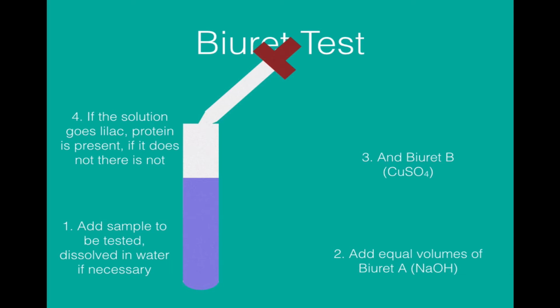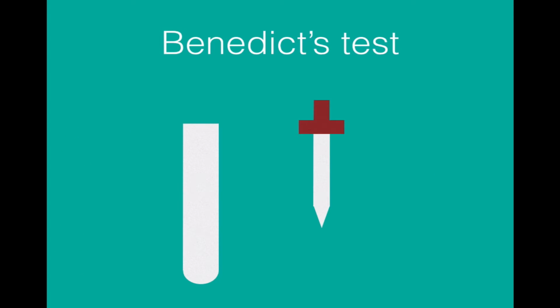Now, if the solution turns lilac, protein is present. If the solution does not turn lilac, so if it stays kind of a light blue color, there's no protein present.